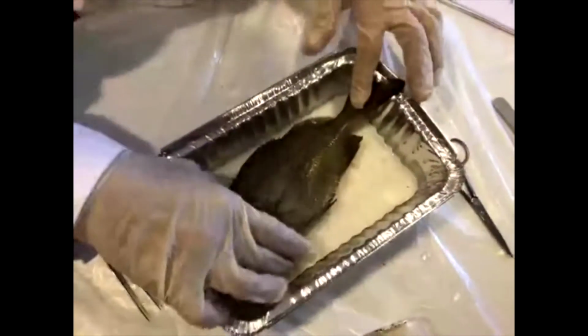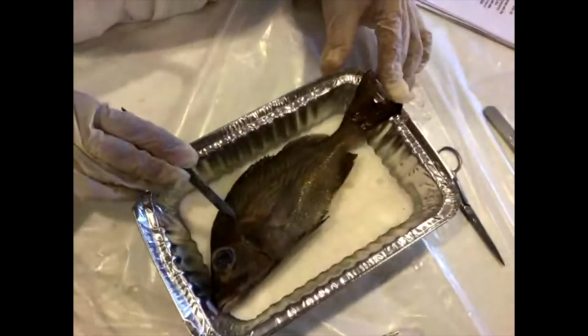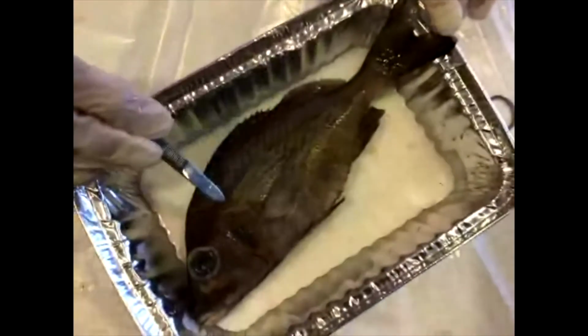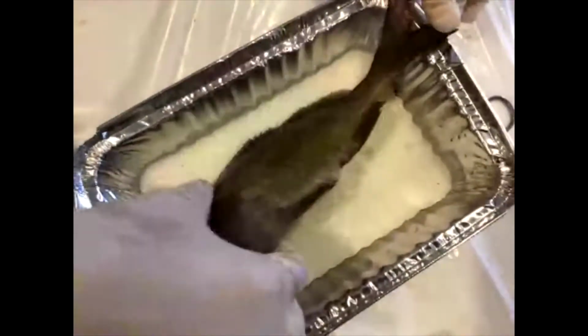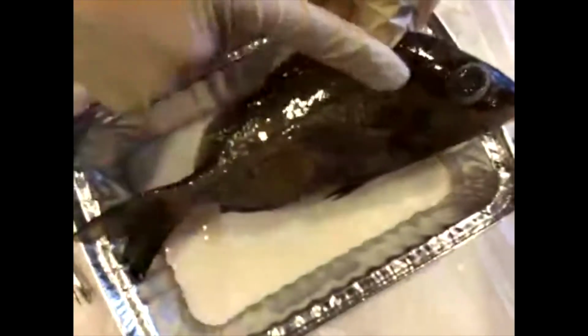Actually, there's one more thing that I want to show you that's actually really cool. So what you might be able to see along the fish is kind of a dark line along their body, just above kind of the midline. I think it's a little bit better to see over on this side. So you can see this dark line running around, and we're not going to be able to see it.